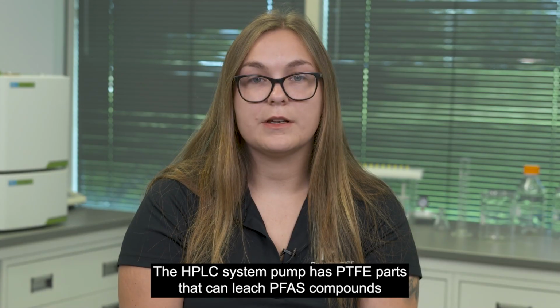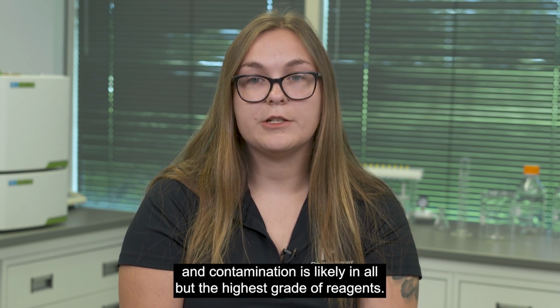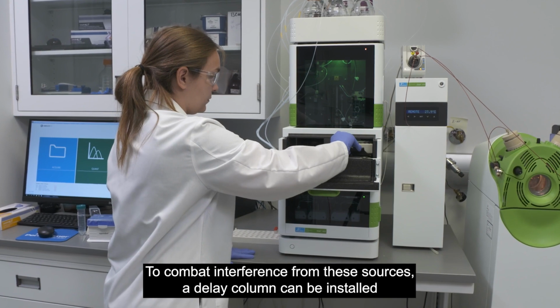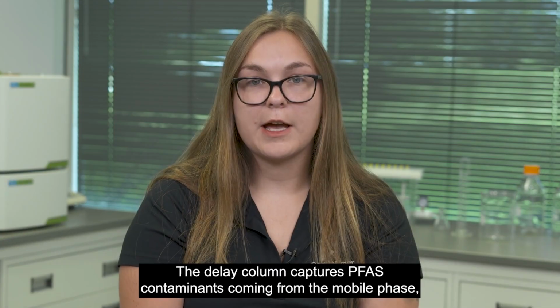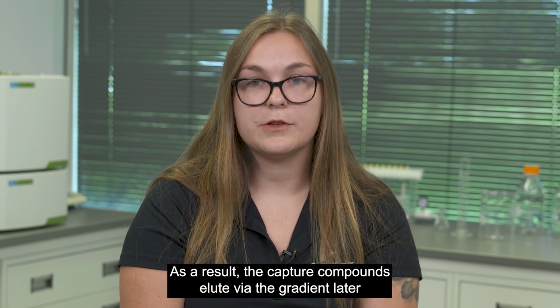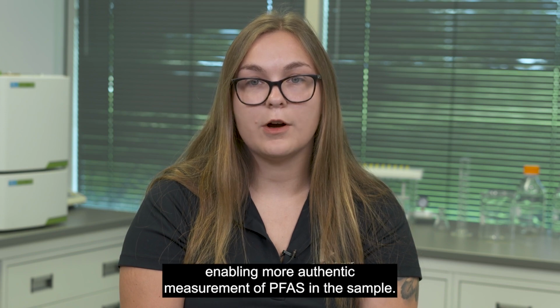The HPLC system pump has PTFE parts that can leach PFAS compounds, and contamination is likely in all but the highest grade of reagents. To combat interference from these sources, a delay column can be installed in the flow path between the pump and the autosampler. The delay column captures PFAS contaminants coming from the mobile phase, the solvent lines, or the pumps before they reach the autosampler. As a result, the captured compounds elute via the gradient later than the analyte peak in the sample, enabling more authentic measurements of PFAS in the sample.